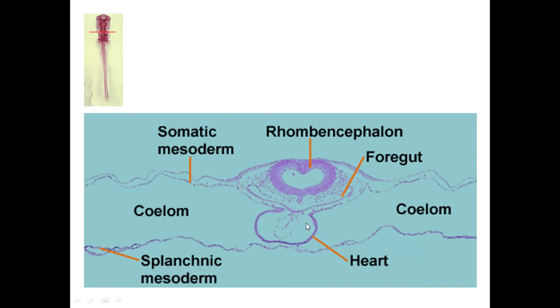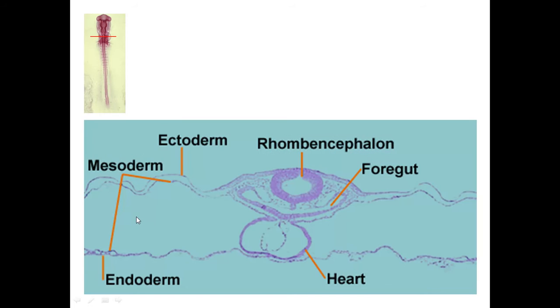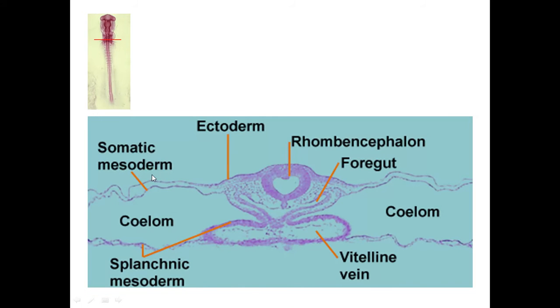Furthermore, we are seeing a more defined cut of the heart, which is now said to be within the coelomic cavity. This one is still the heart. Okay, right. So lower, we're making a cut on the extensions, the endocardial extensions of the heart, the two blood vessels.